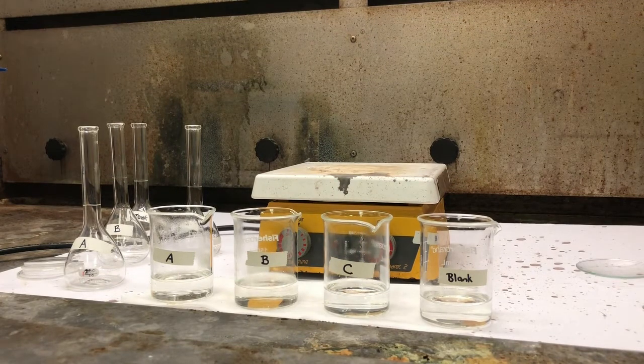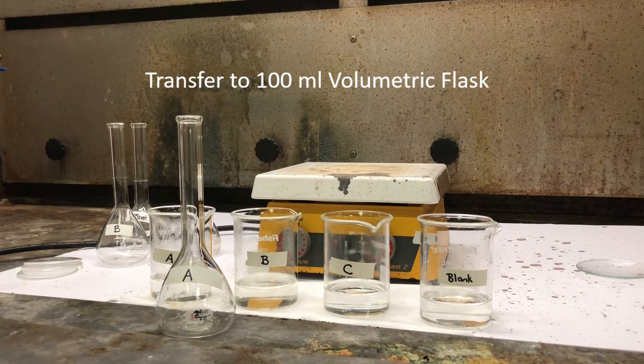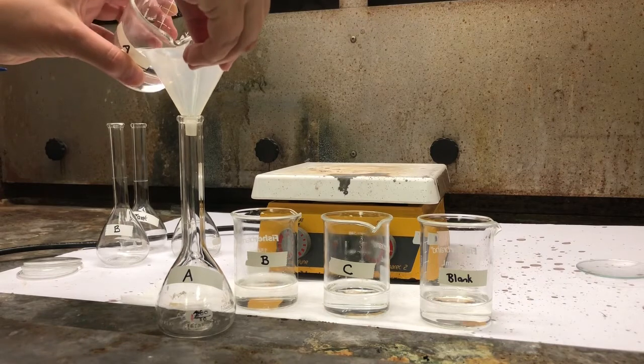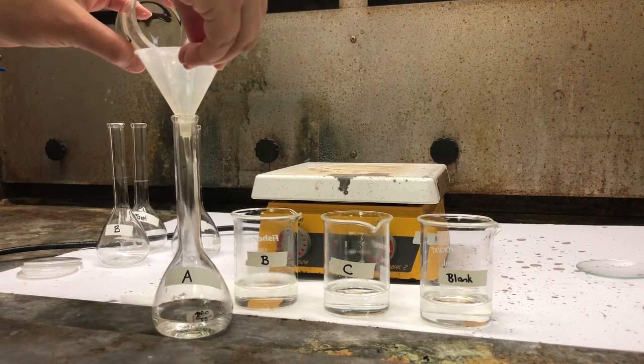Now that our samples have cooled down, we're going to transfer them to a volumetric flask. I'm going to transfer each one to a 100 ml volumetric. We don't actually need to filter these samples because they are water samples, so there's no organic material or debris or anything like that in them. So we're just going to pour our sample into a volumetric. This is a 100 ml volumetric.